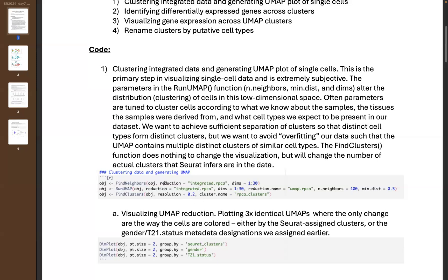The next step is FindClusters, which doesn't affect the way the clusters look, but the resolution parameter does affect the number of clusters that are identified. With a higher resolution parameter, Seurat is going to infer the presence of more clusters from an identical plotting shape. A lower resolution will identify maybe only one, two, or three clusters from the exact same plot.